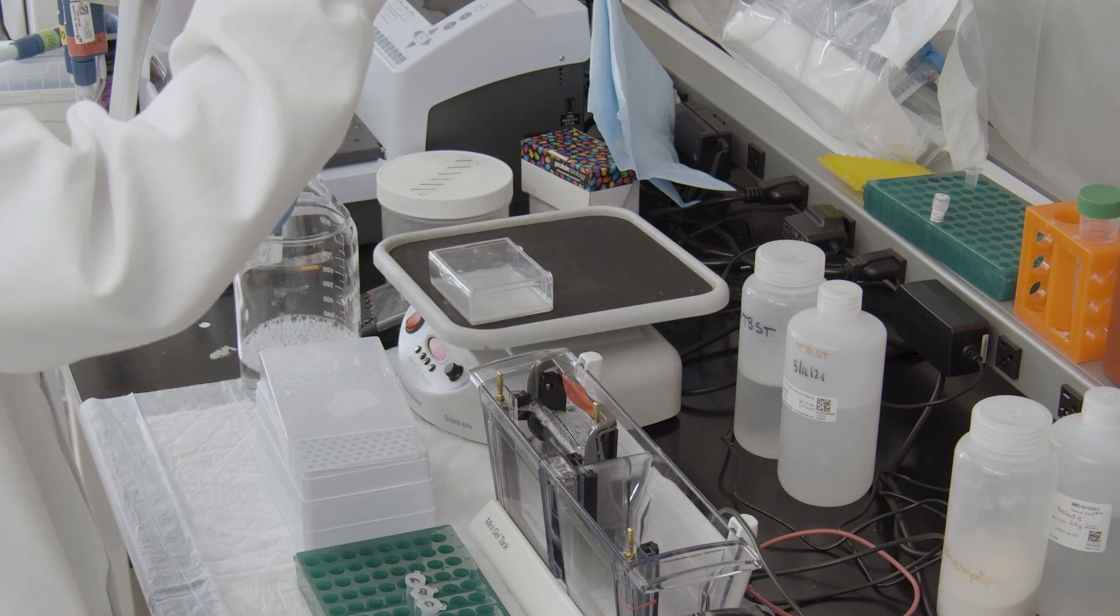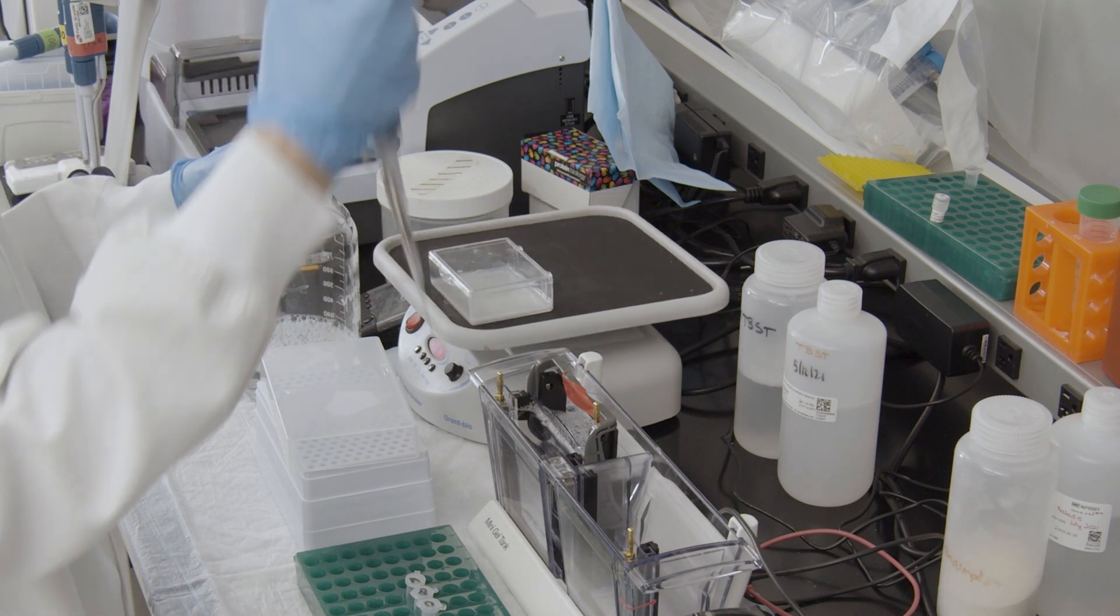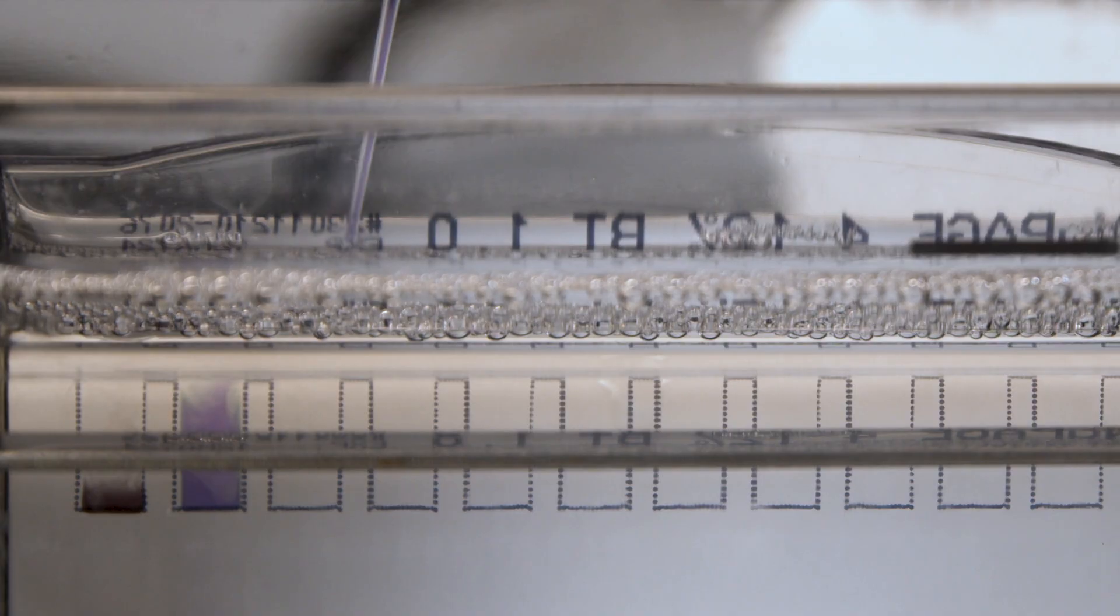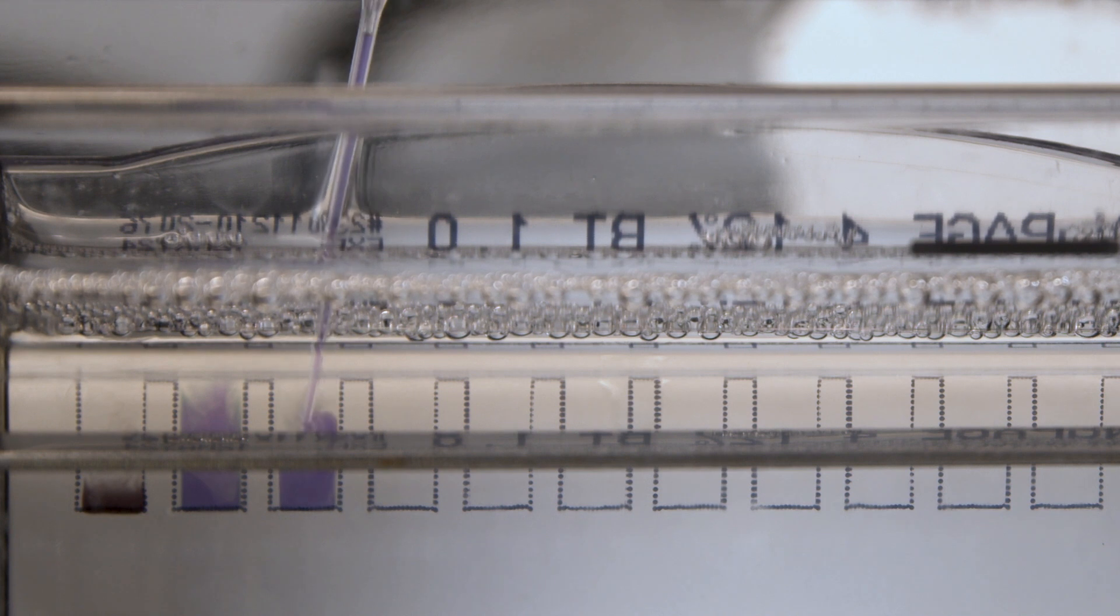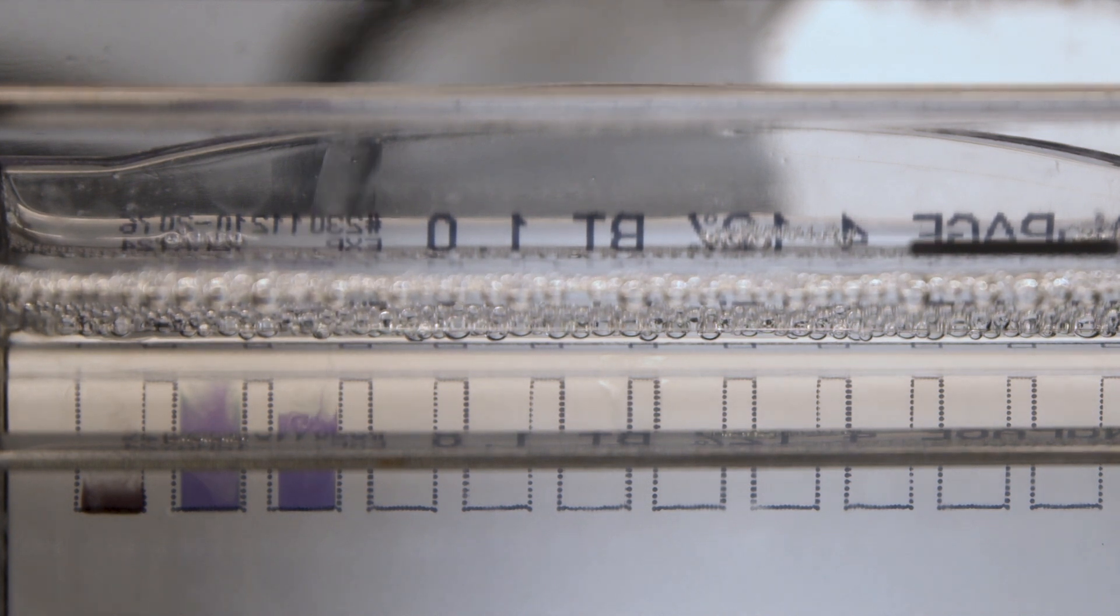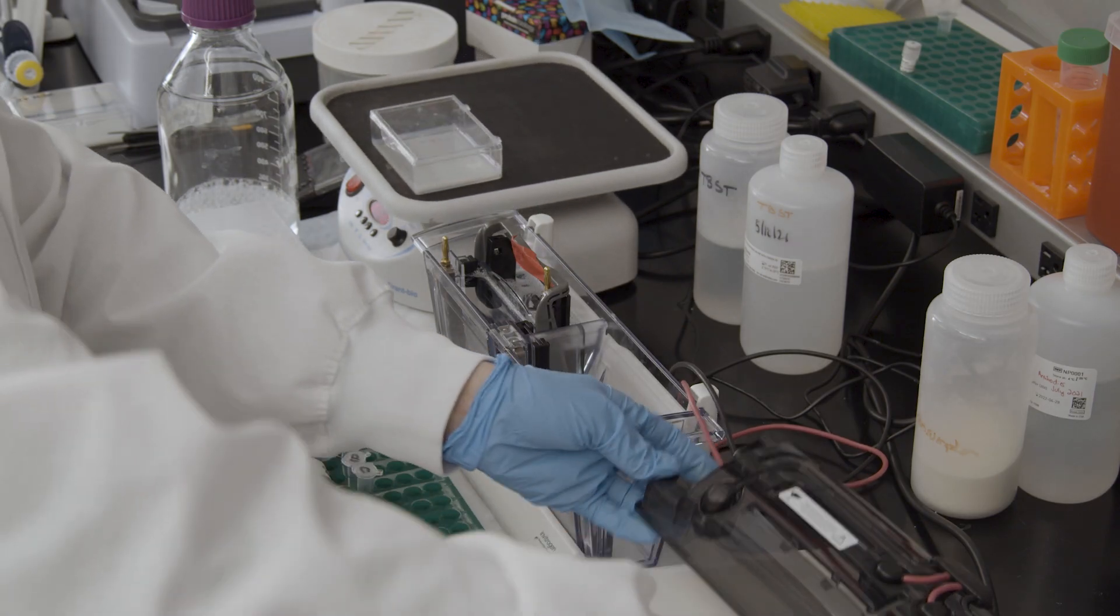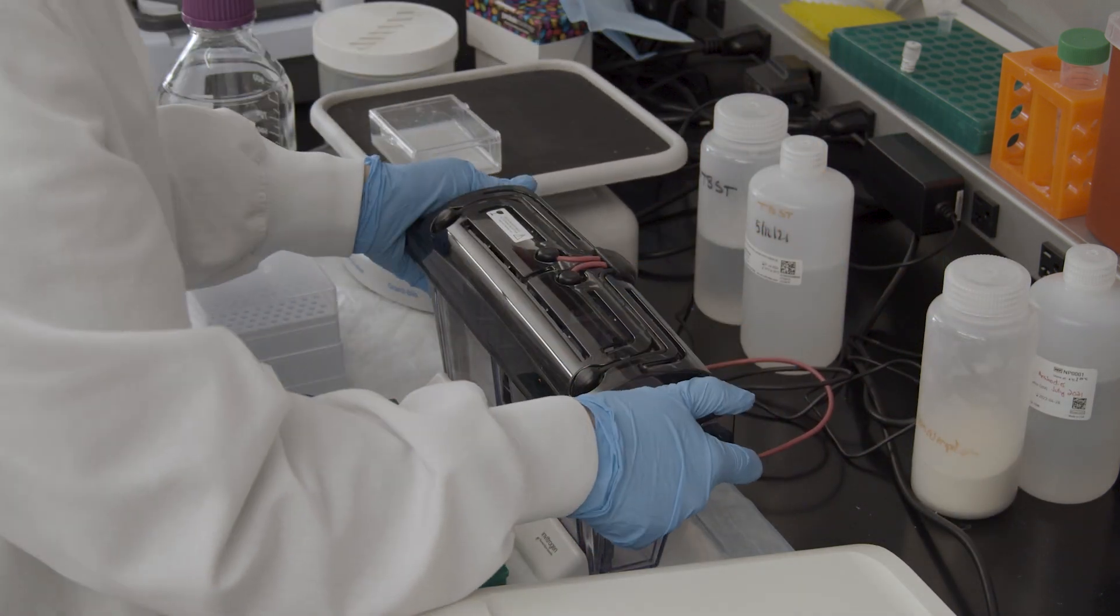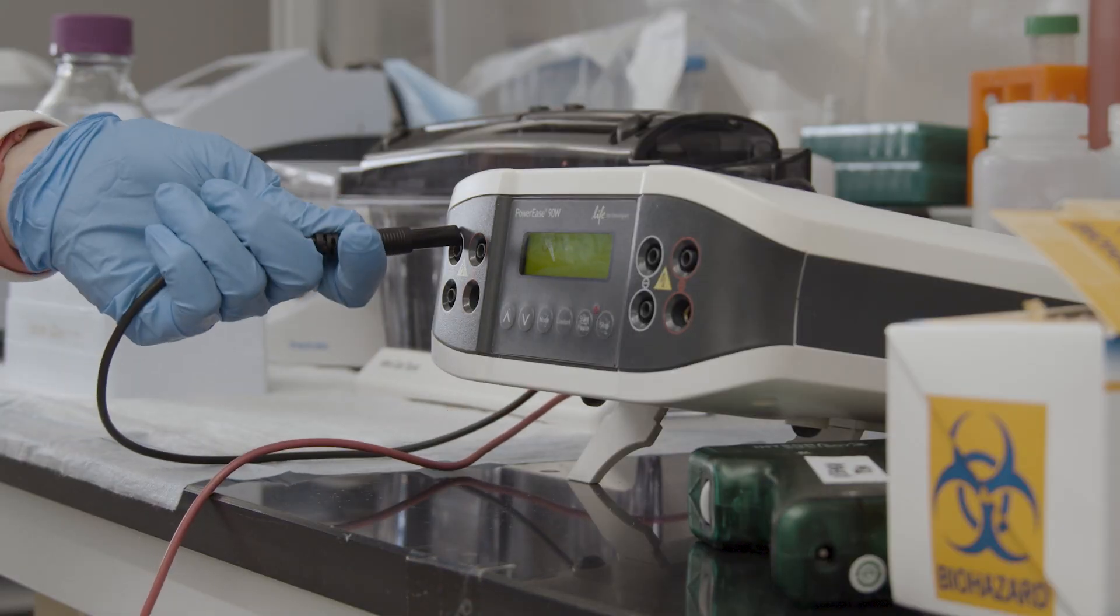Using gel loading tips, gently load a pre-stained protein standard into a gel lane. Then pipette each sample into its own lane. Be very careful not to introduce bubbles when pipetting. Attach the electrodes to the electrophoresis chamber and connect to the power supply.